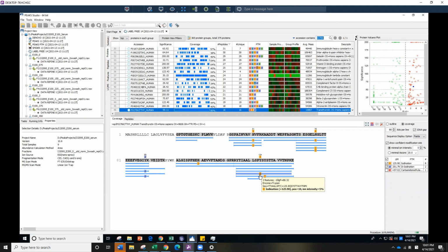So we want to go back to our raw mass spec data to know whether it is because mass spec selects precursors to fragment randomly if you're not doing a targeted method, and we run a standard method, not a targeted method, so it will be harder.